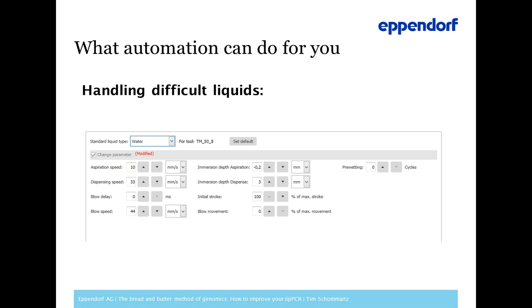And then we have an unskirted or non-skirted plate, and that basically means that it does not have any sort of frame. So if you look from the side, you can see the whole well. For a semi-skirted and a non-skirted plate, if you work with that on a robot, you usually need an adapter to securely place it on the deck.